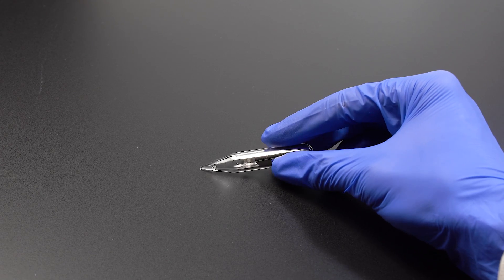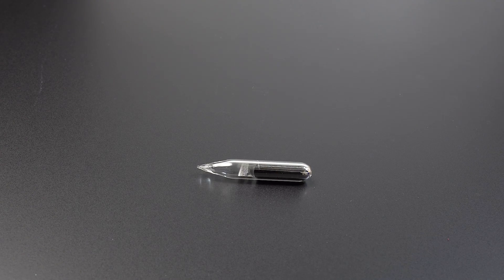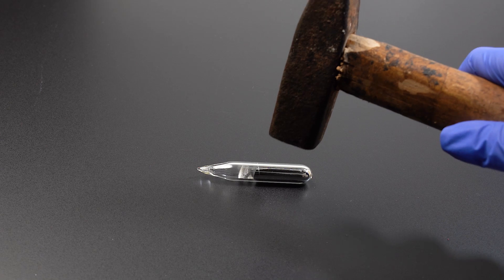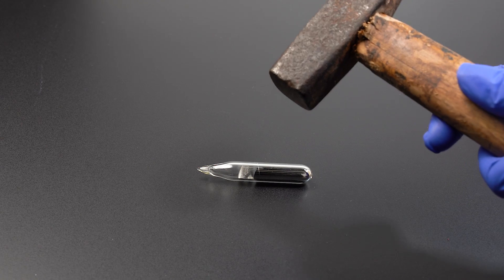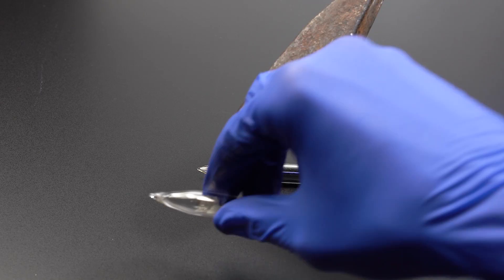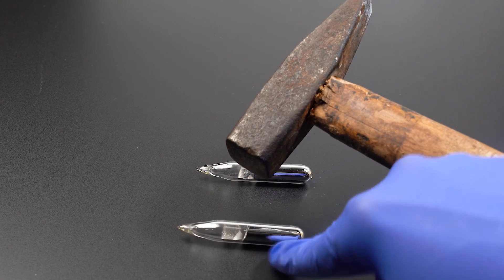Okay guys, now it's time to crush our precious ampoule with rubidium. Relax, guys — of course I will not crush this ampoule. If I do, there will not be any reactions with rubidium that I promised. So instead, I will crush this other ampoule.